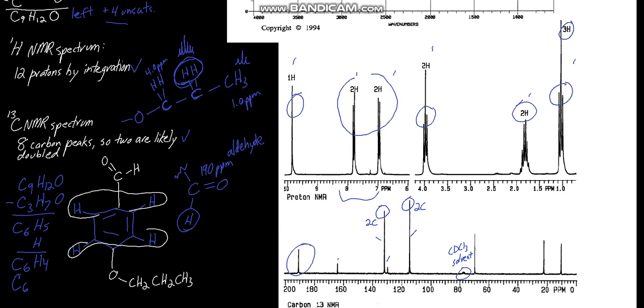Okay, so what else can we point out? Other key features. These 2 little much shorter carbons, that is typical of quaternary carbons. What are quaternary carbons? Carbons without any hydrogens attached. Those likely are the points of attachment of these 2 substituents. The 164 ppm has got to be the more deshielded carbon that's attached directly to oxygen. So overall, you want to use a systematic method like this. There's our 4 aromatic hydrogens, nothing left.